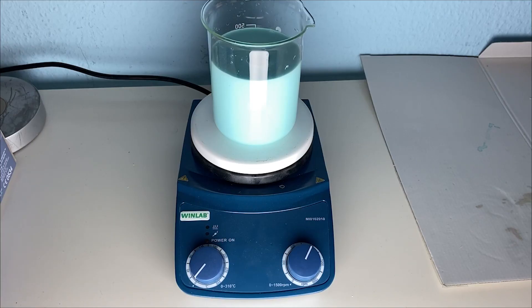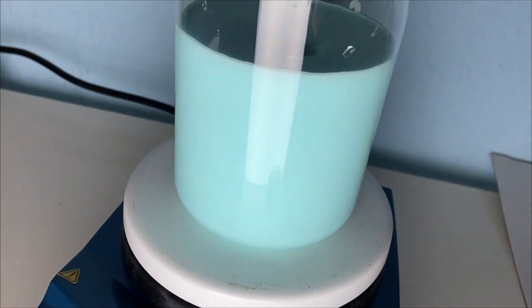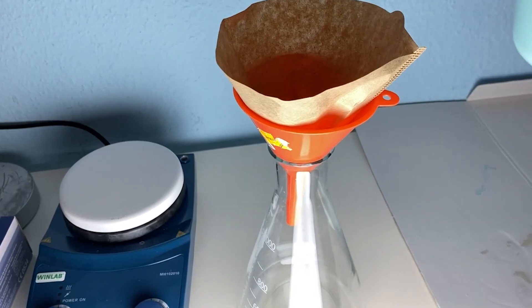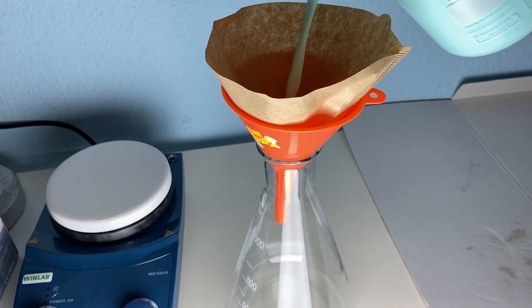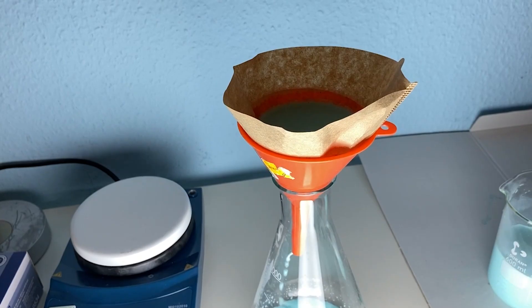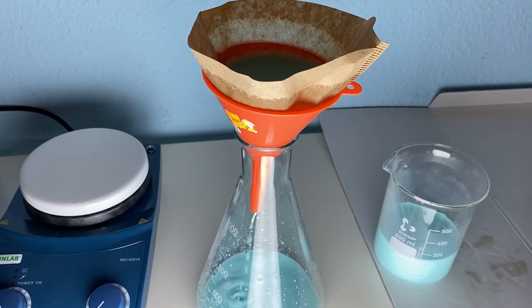I let it stir for a few more minutes to make sure everything has reacted. After that I took it off the stirring and then started the gravity filtration. Unfortunately the filtration didn't work really well, probably because the filter paper had a leak or something.